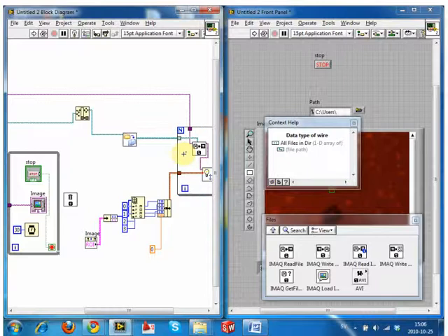How is the order determined? In this case, it's determined numerically. But what happens if you get two arrays coming through? How does it understand which one to cycle, or does it cycle everything? It'll do it for the largest number, and if it runs out of data, it will give you an error. It'll say that the indexes are not matched.